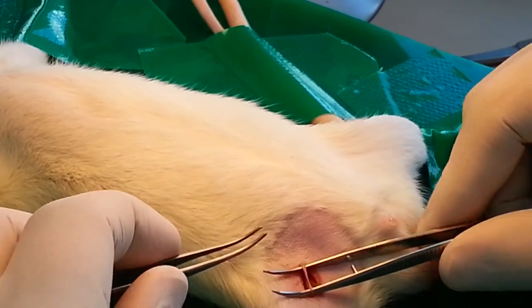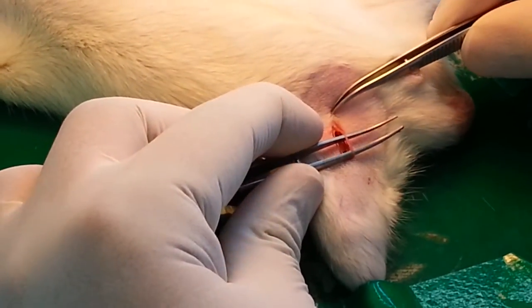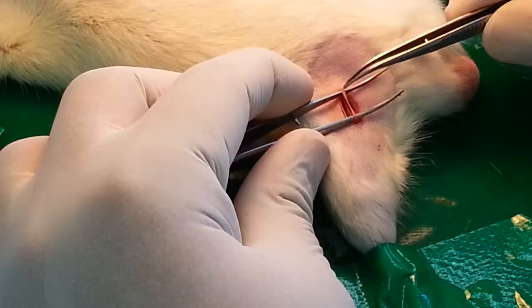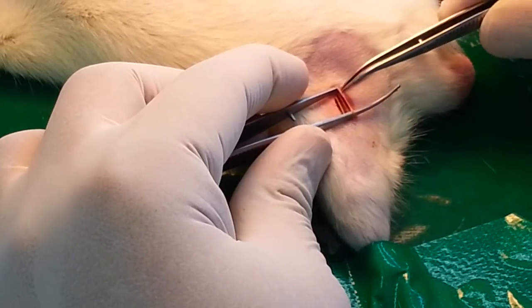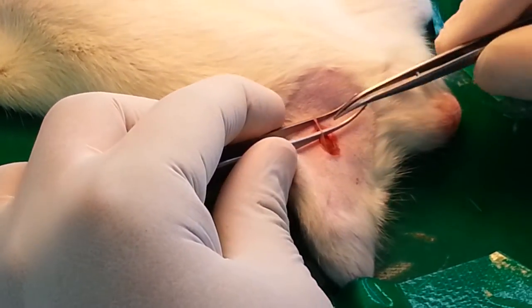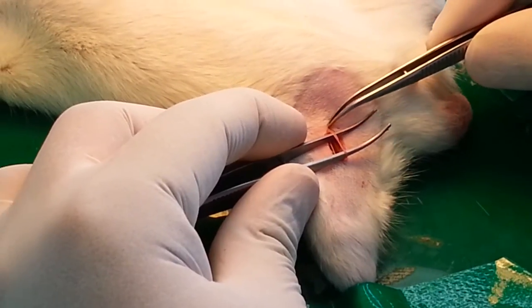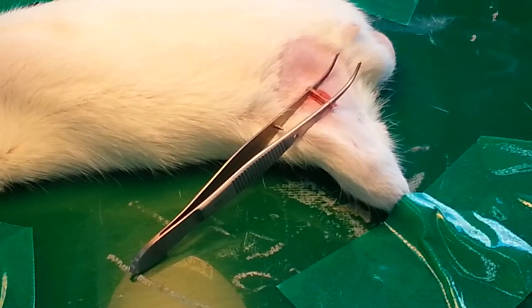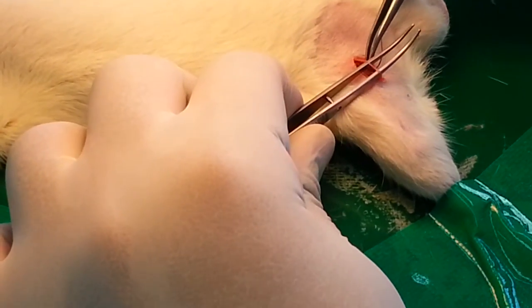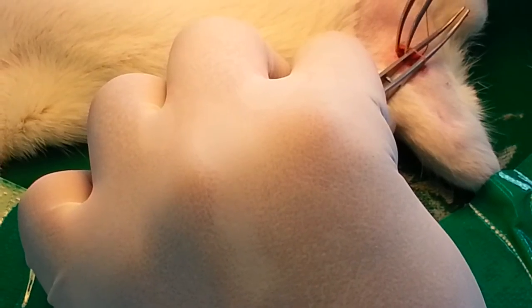Since we are doing cannulation for the artery, we will make the artery the main subject. There are Y-shaped portions on the upper side as well as on the lower side — we need to make those clear. We will cannulate here. Now since this is done, we need to put thread on both sides. The first thread goes on the upper side of the artery so that blood flow is temporarily stopped while we cannulate.